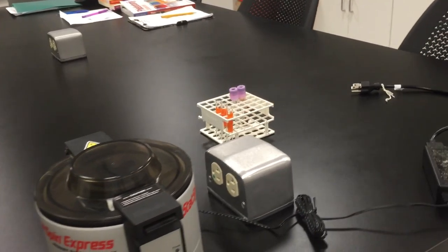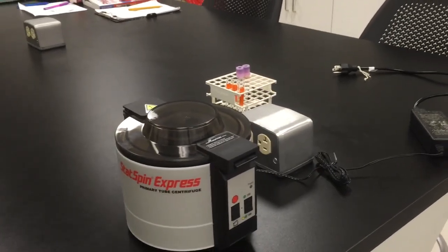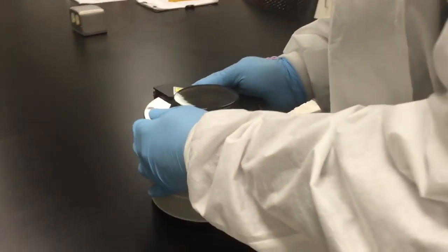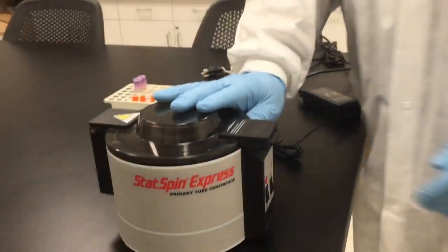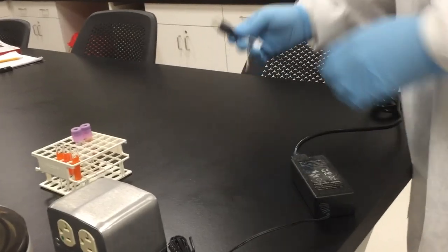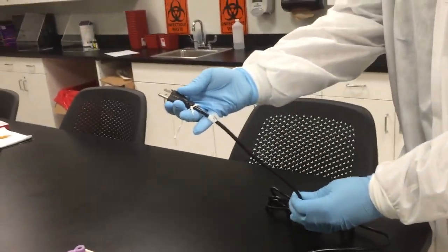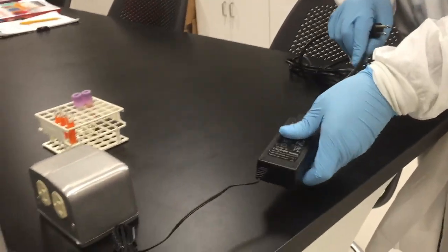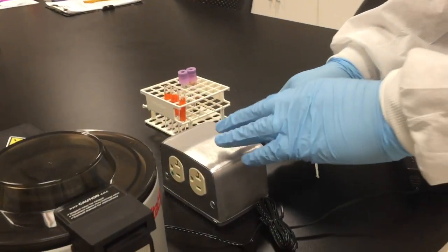First things first, you want to make sure that your equipment is in proper working order. So you're going to inspect everything. Make sure that it's clean, make sure that it's working, check your wires, make sure that they're not frayed. At this point, when everything checks out, you're going to plug in your centrifuge.